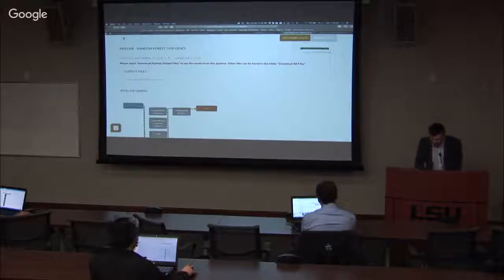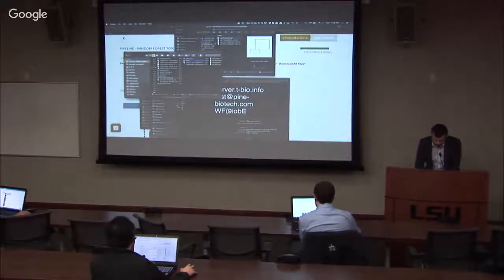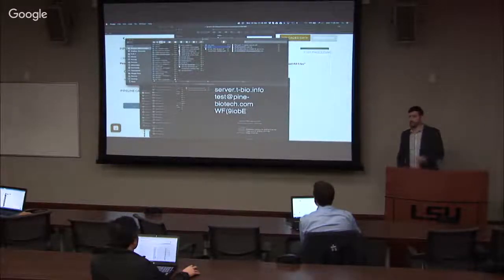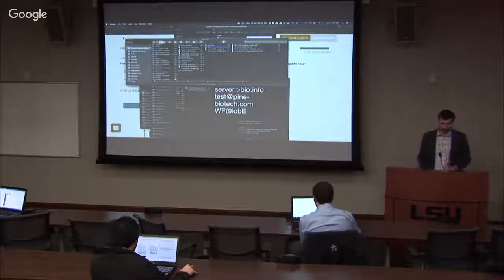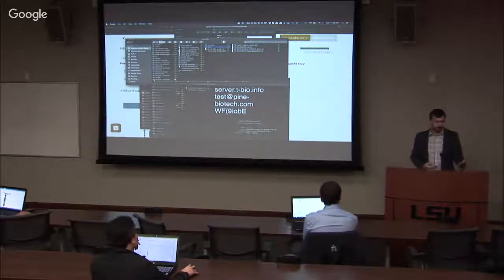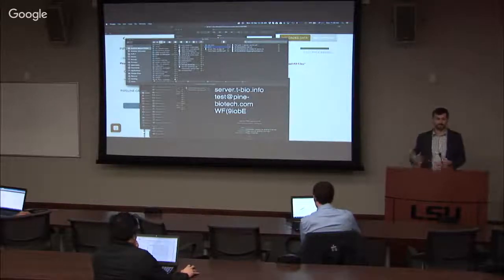So as we're waiting, let me just tell you quickly how to prepare the input files. So I actually have to prepare it for the DCIS, right? In DCIS, what we saw is that there are two classes, maybe three classes, right? I would prefer to say there are three classes, because actually the paper that published this data set, their conclusion was that they identified one class of DCIS patients that was more prone to develop these more aggressive tumors, and some class that wasn't. So that would be our interest. How can we separate them?